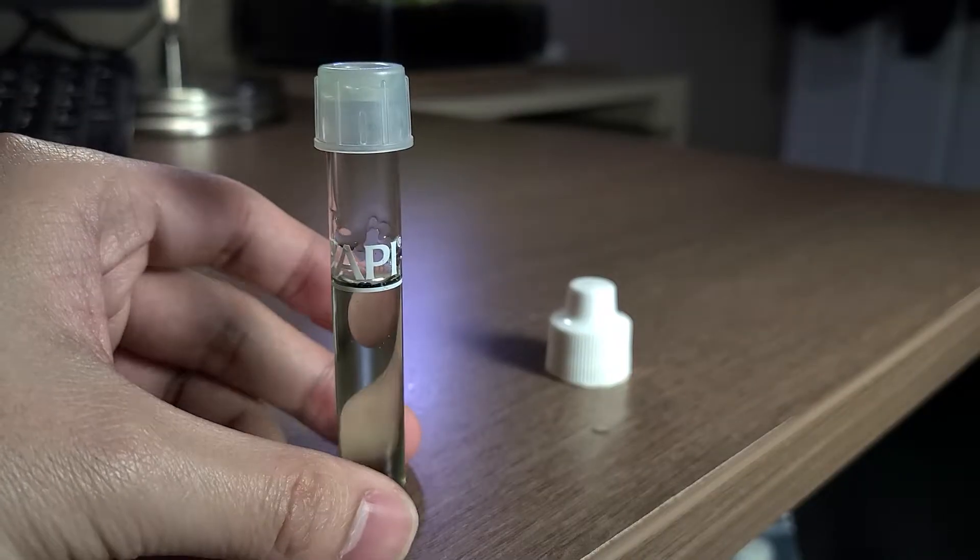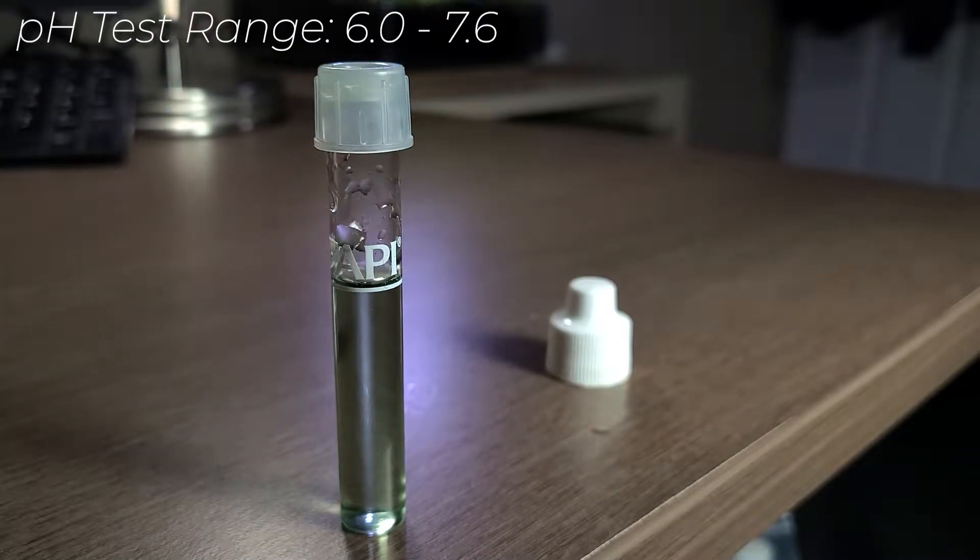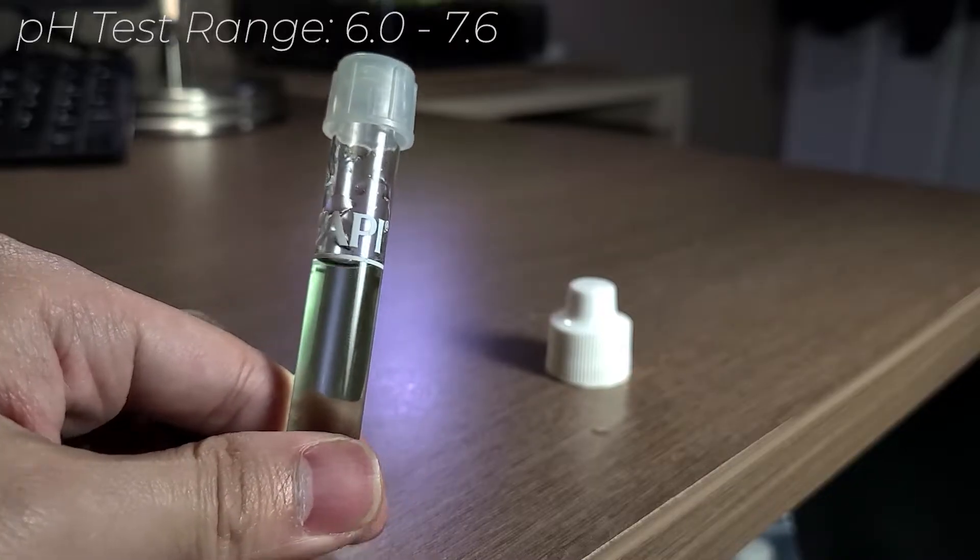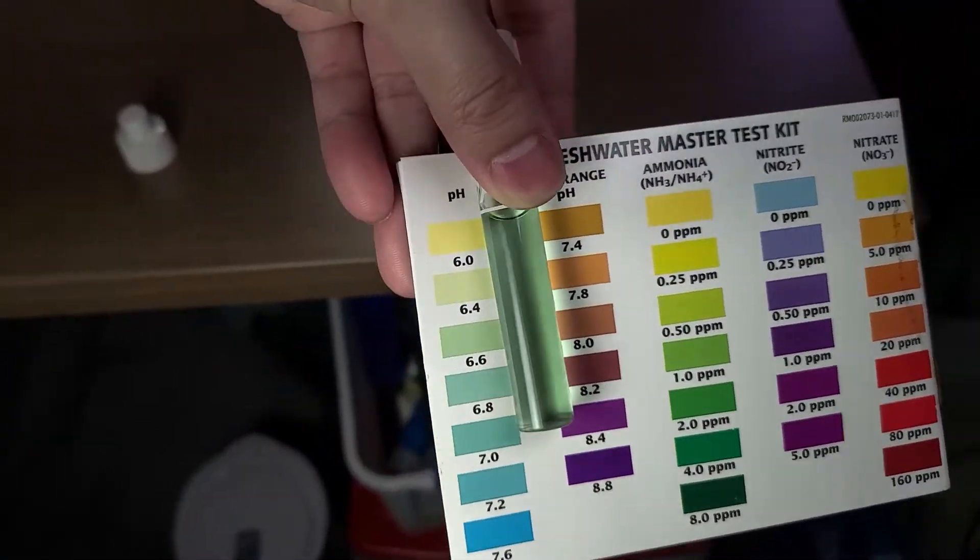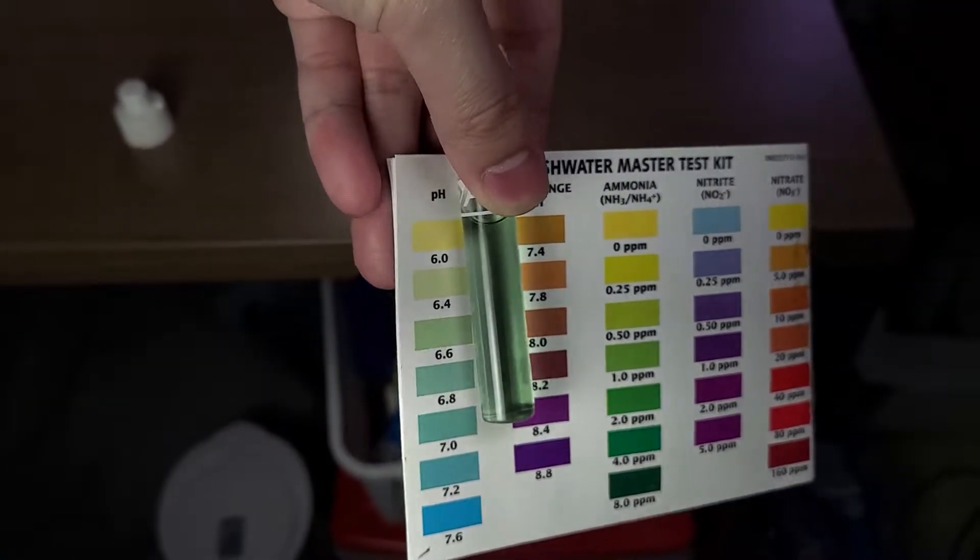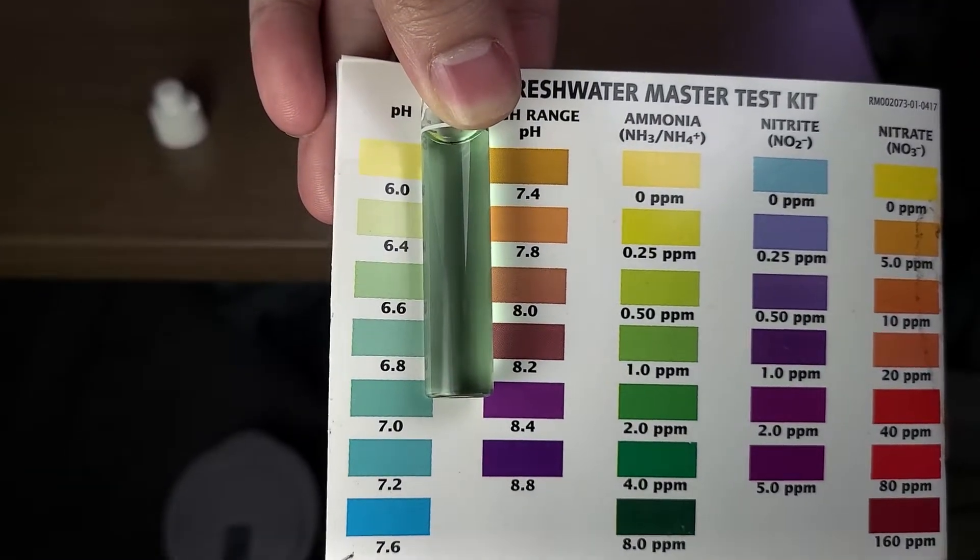This test will measure pH from 6.0 up to 7.6. Viewing the results in a well-lit room will help with determining its exact outcome. And as you can see here, the pH comes to around 6.6.